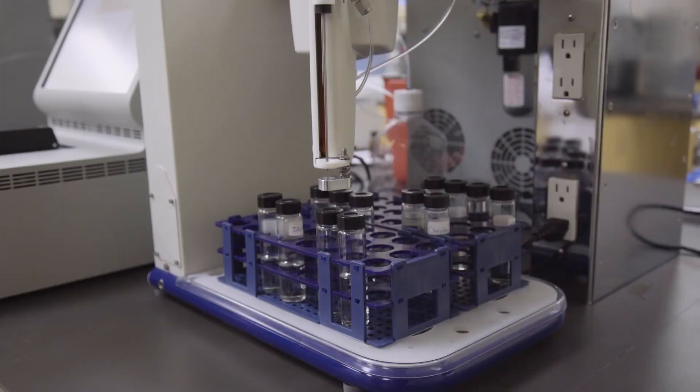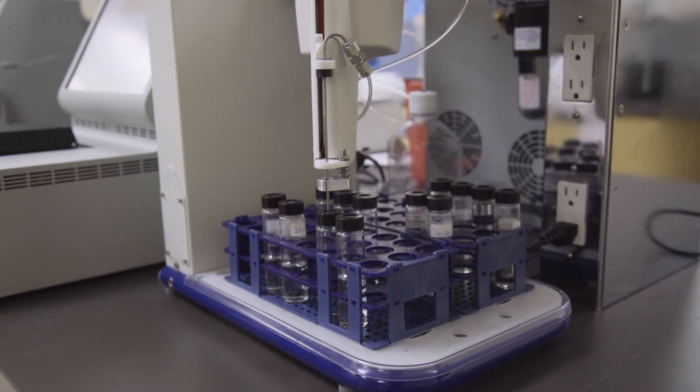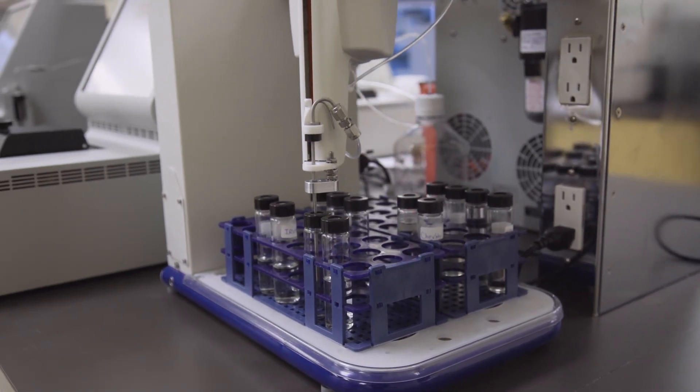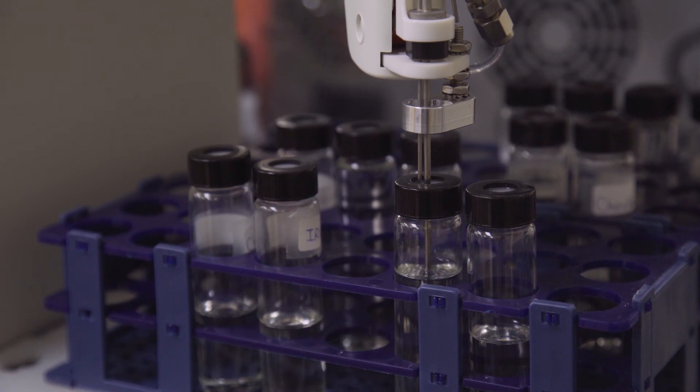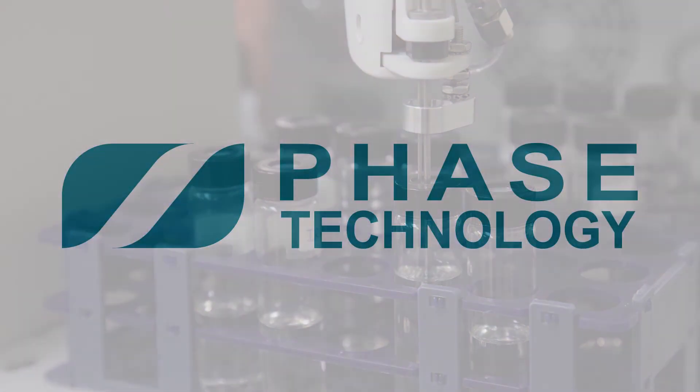Press the start button to start the test sequence. The analyzer will take care of sample loading, testing and cleaning all by itself.